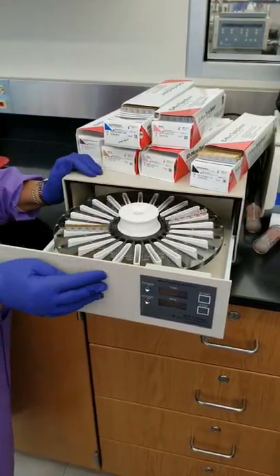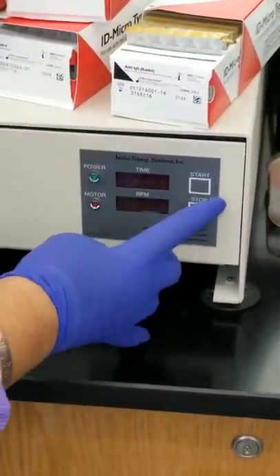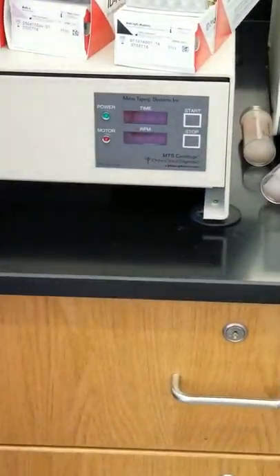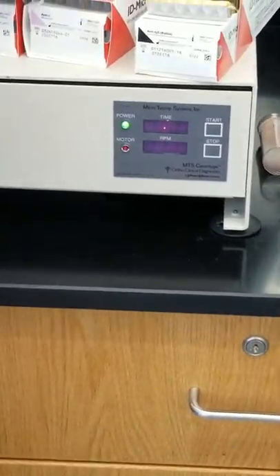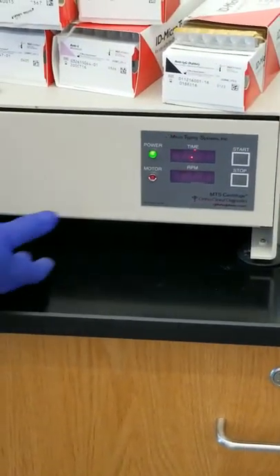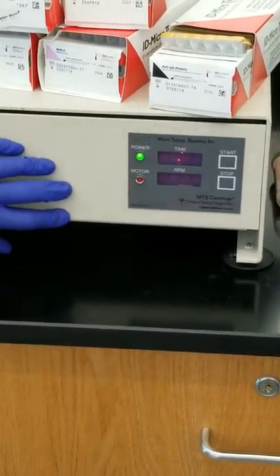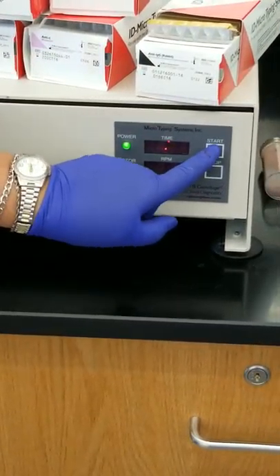All right, so I'm going to put this in, I'm going to shut it, I'm going to hit start. If it's plugged in, this is Jordan, was my chemistry professor. The thing doesn't work, it's usually not plugged in. Okay, all right, so have the power on. I'm going to hit it. It should lock, and you hit start.